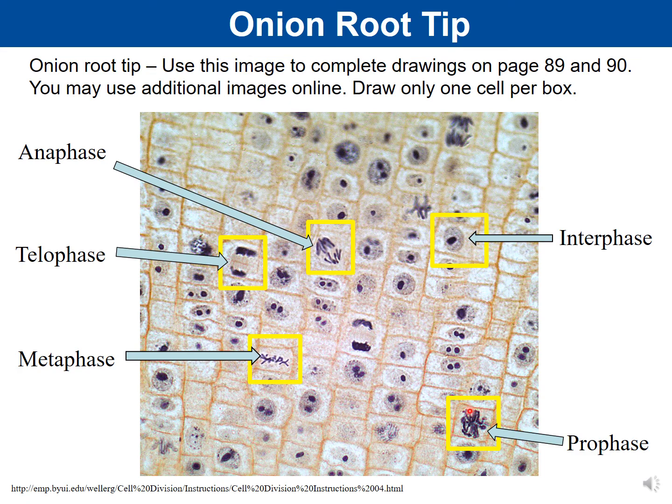So this would be an example of prophase. We don't really have a nucleus anymore, but we do have chromosomes. The edge here is your cell wall and cell membrane, and the space in here is going to be your cytoplasm. So that's your cell that's in prophase.